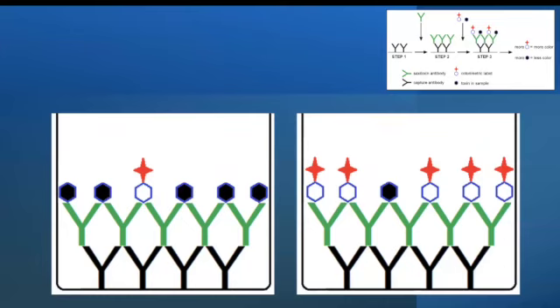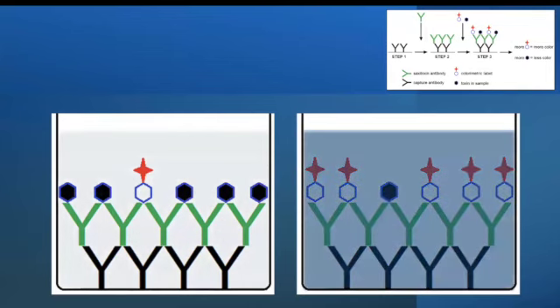If there's enzyme in the solution, as in the HRP conjugated saxitoxin on the right, then the solution will turn more blue. If there is little to no enzyme captured, because all of the antibody binding sites were outcompeted by toxin in the sample, as is on the left, then the solution turns less blue, if at all. Sometimes it's just clear.